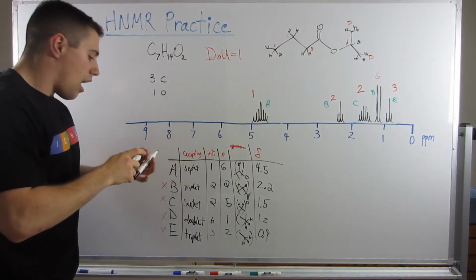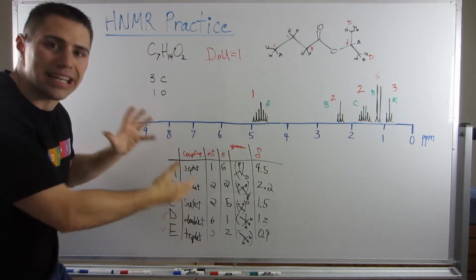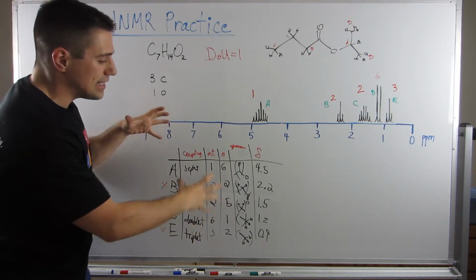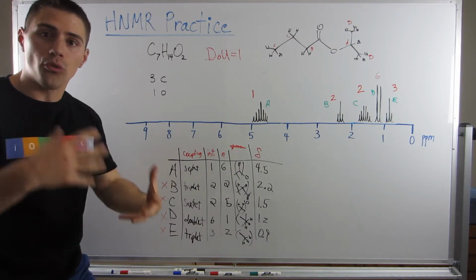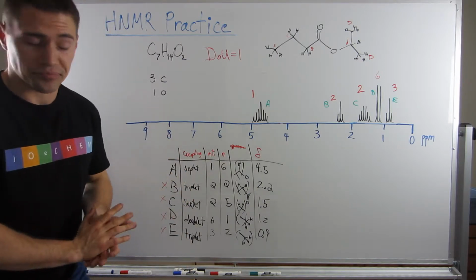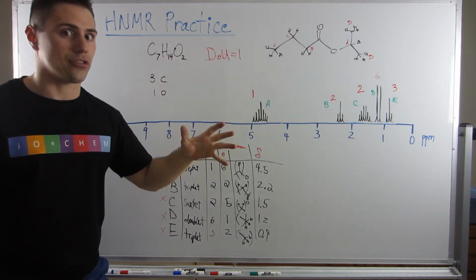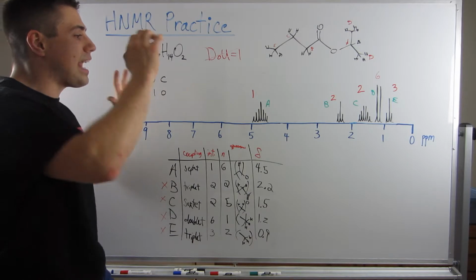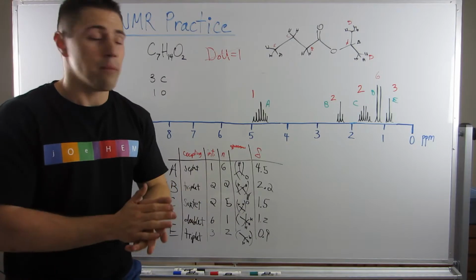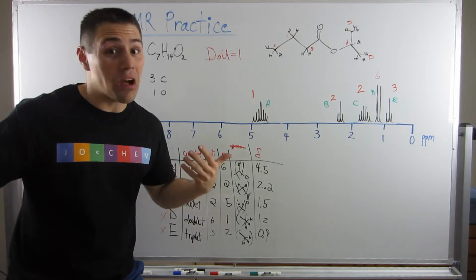So, obviously I knew the answer, but you can go through this type of process and just check yourself. That's why it's so nice to have everything laid out in the chart, because the chart is your source of truth. This tells you everything, but it's nice to see it all laid out in a logical format that you can understand, which is why if you like to organize the chart differently, by all means, please do that. Okay, this was actually a question on my Organic 1 final in 2013, which seems like forever ago, but if you can kind of handle and dissect this spectrum, get this chart and deduce this structure, you're already in good shape. Okay, I have 2 more problems, and then we'll call it a video, a series, a wrap.